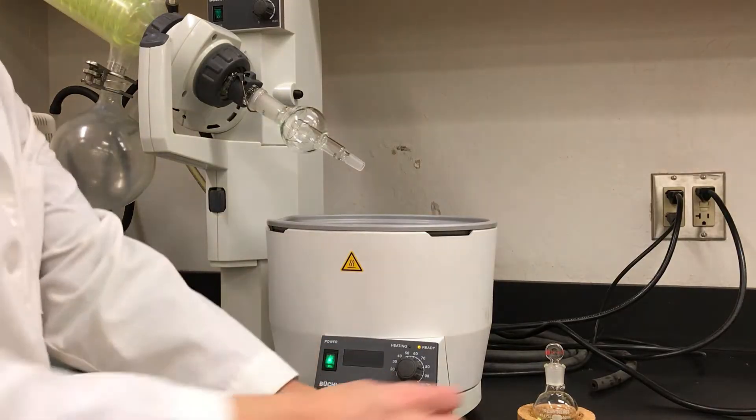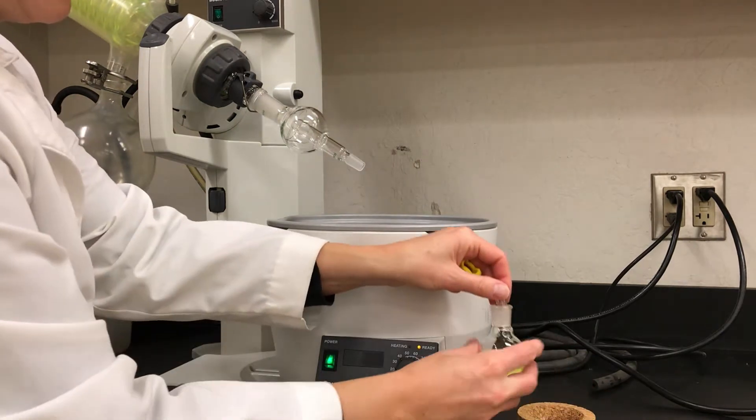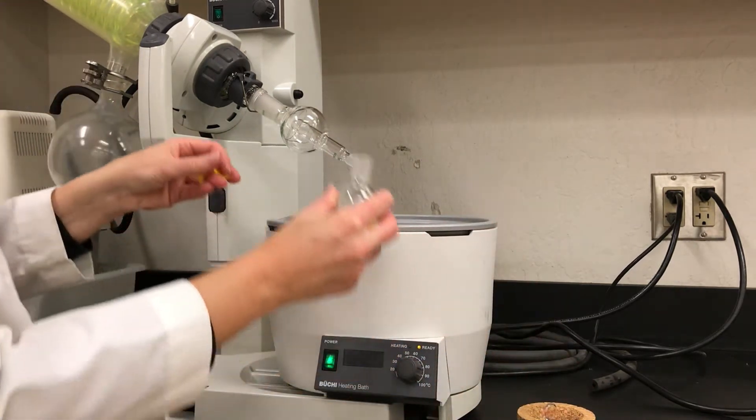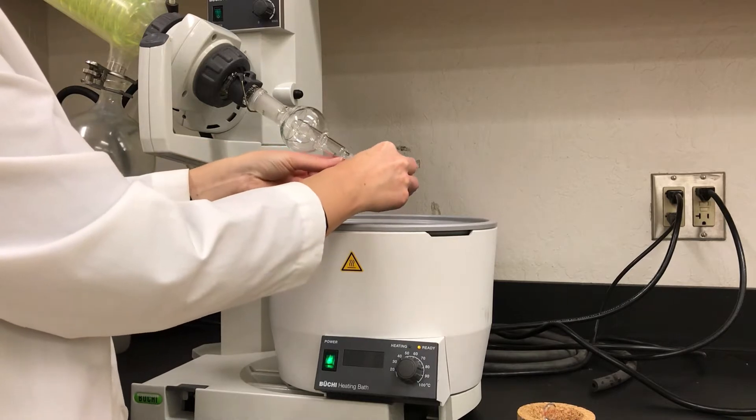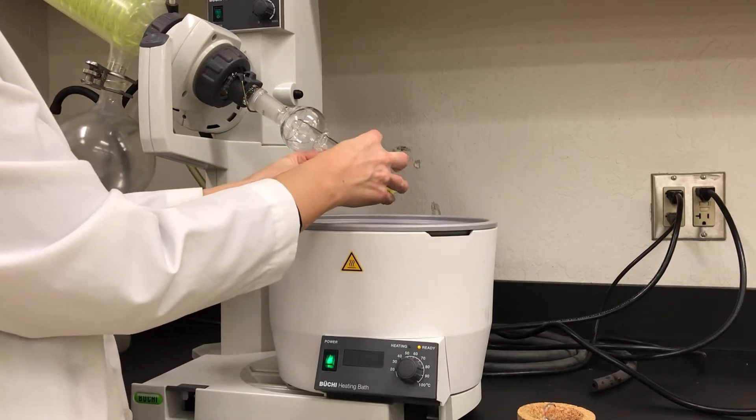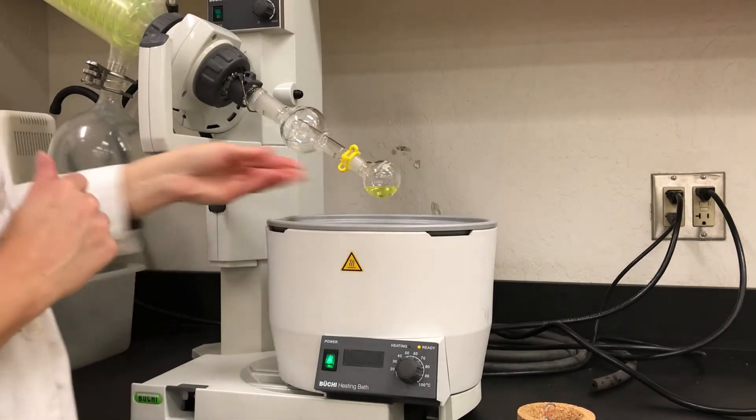First I'll connect my flask to that bulbous glass piece which is called a bump trap and we'll connect it with a plastic clip. You do want to make sure that your flask is no more than half full or else it will bump.